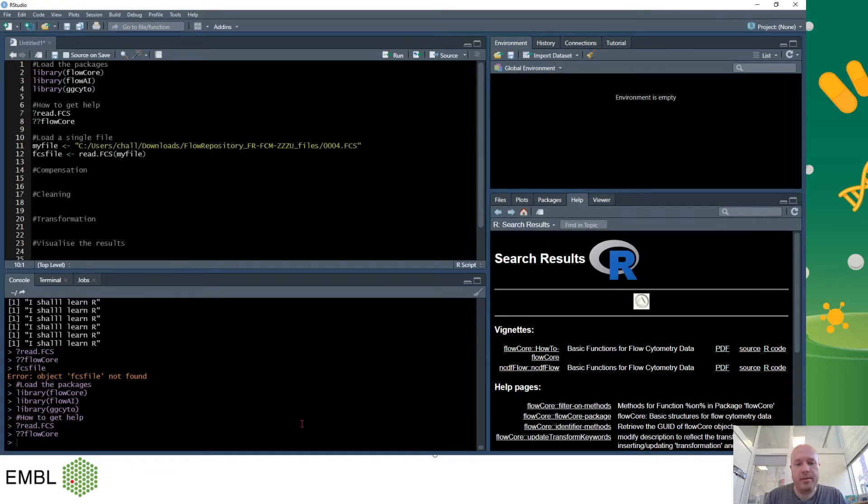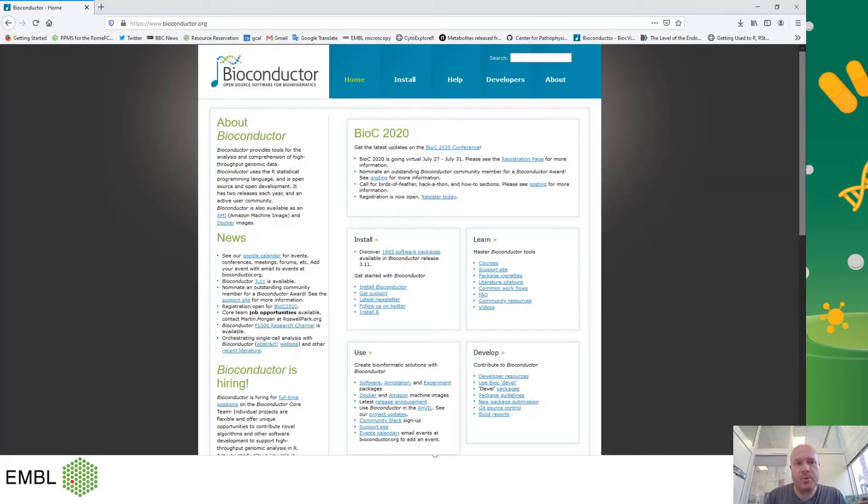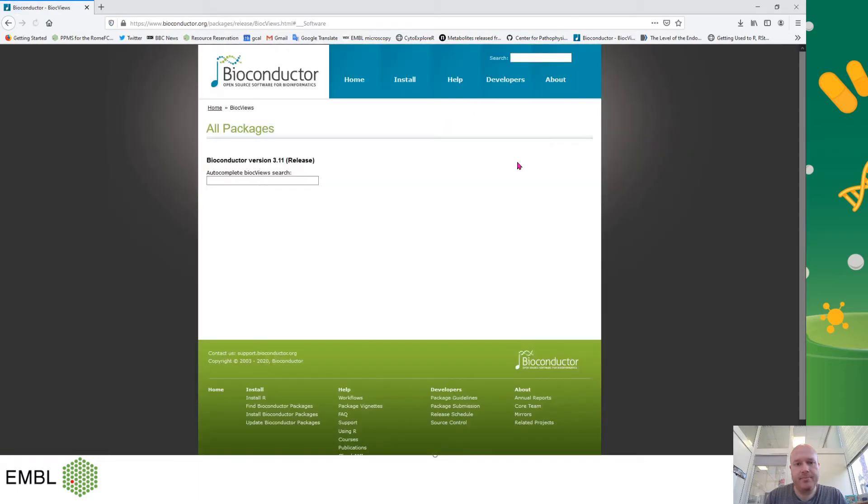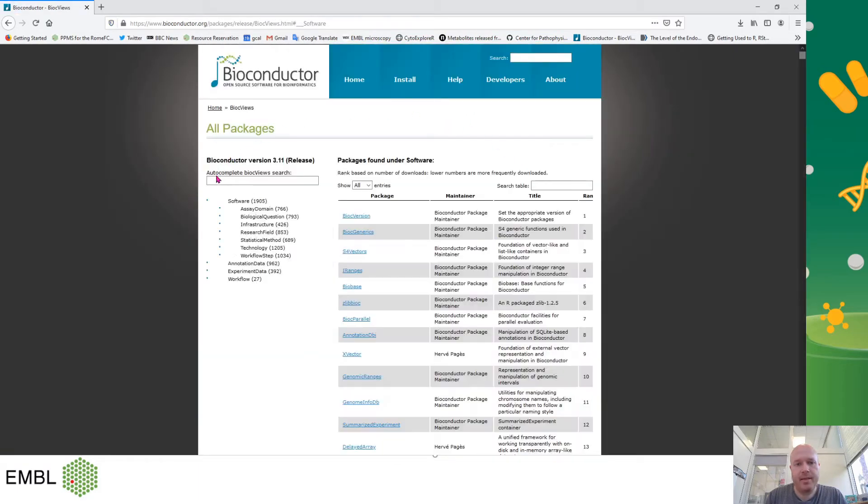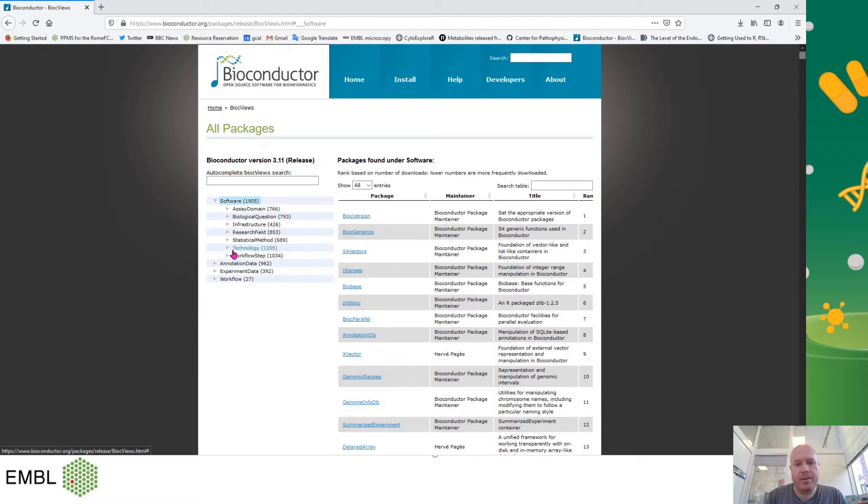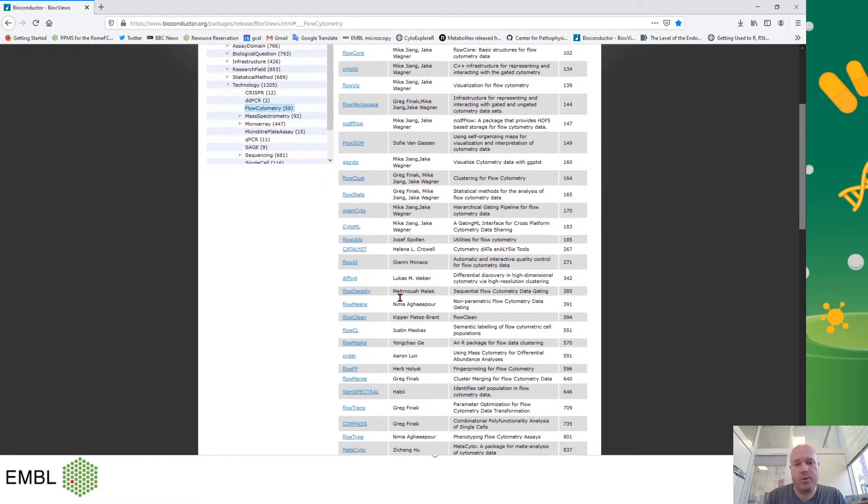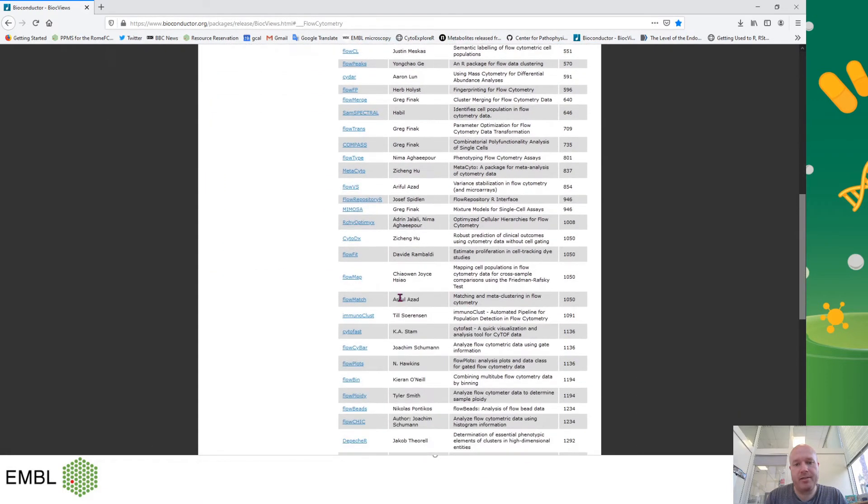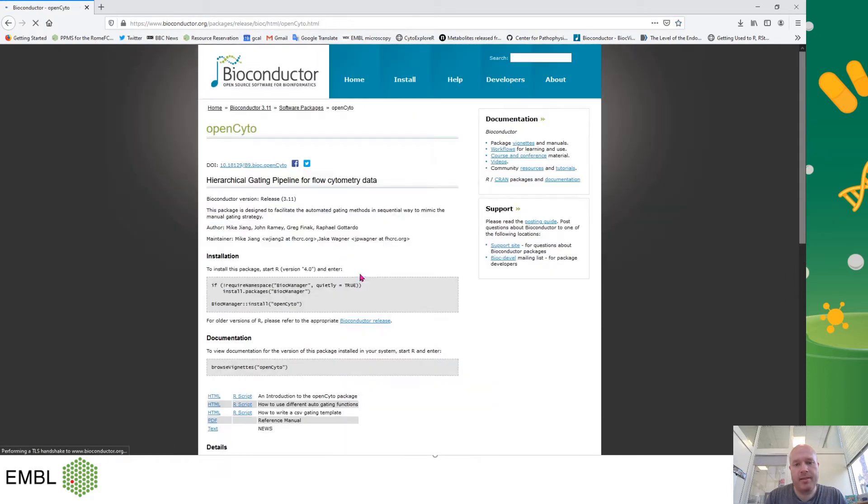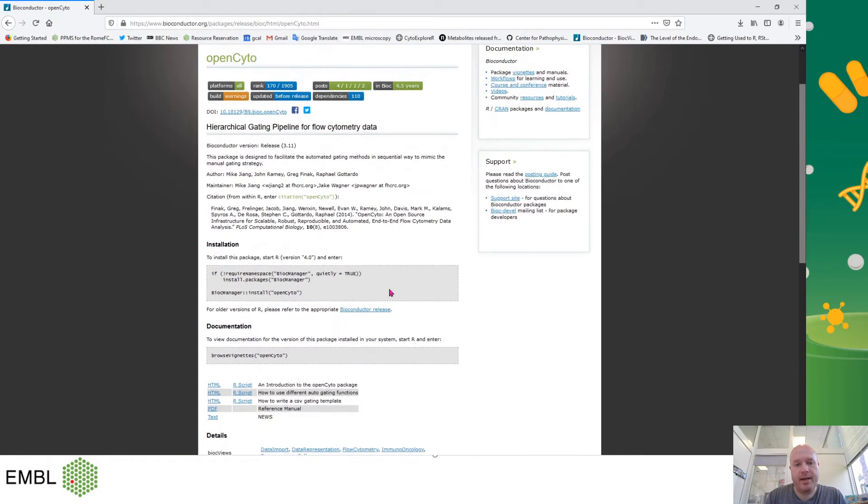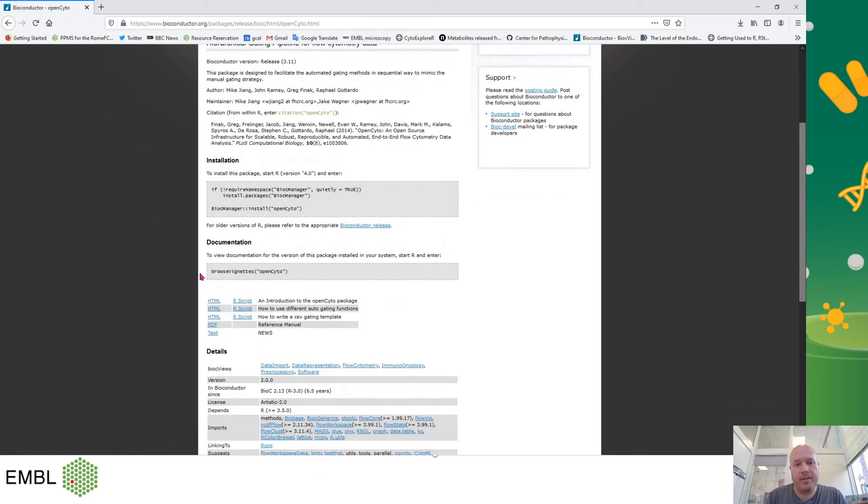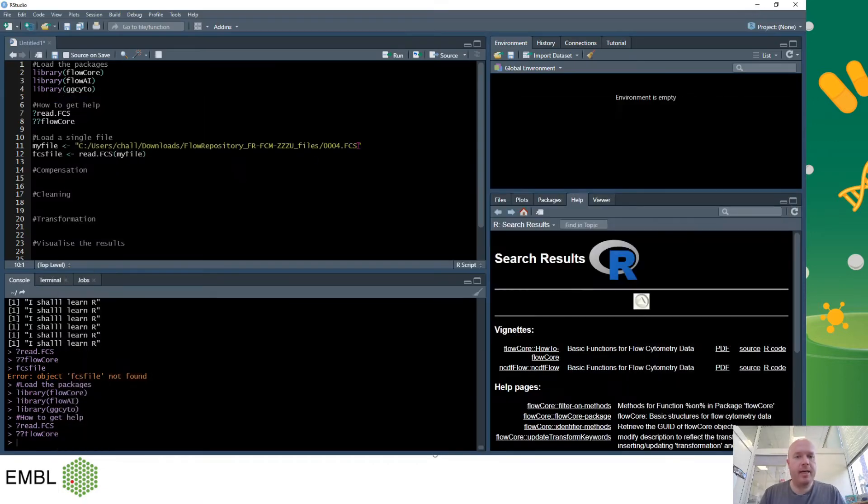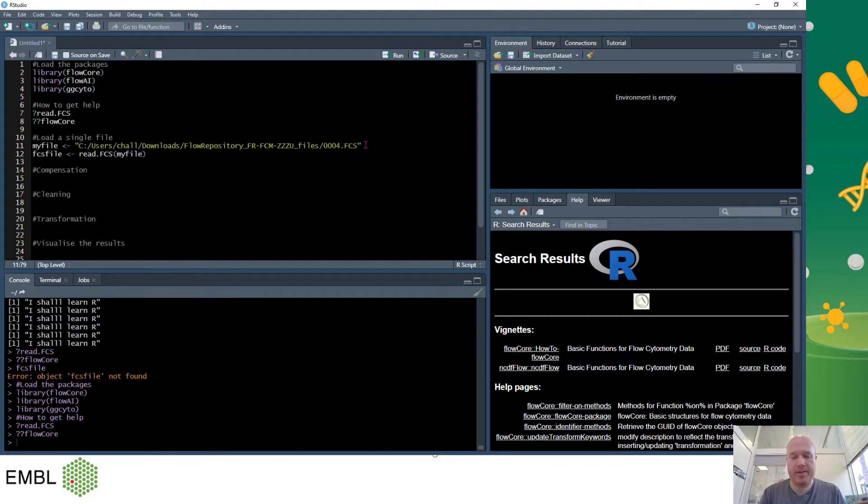The other way to find help is to go to the bioconductor page, click on help, click on packages and on the left we can search under technology for flow cytometry and here we have all packages related to flow cytometry. We can click on one of these and we have the documentation here either in the form of HTMLs or PDFs or example scripts. So today I will be typing in most of my commands so it makes it easy and you can see how we actually interact with RStudio.